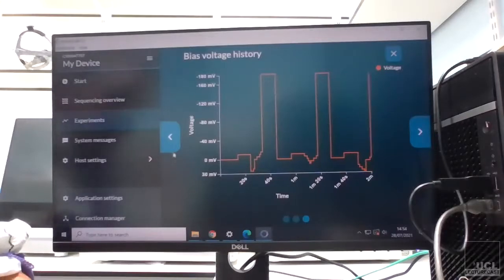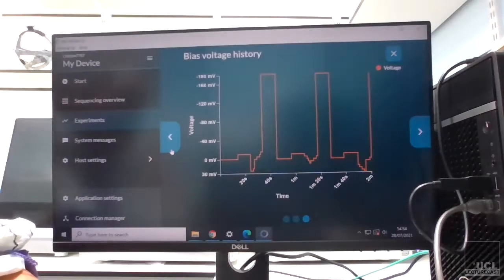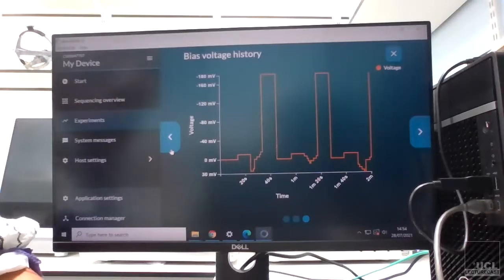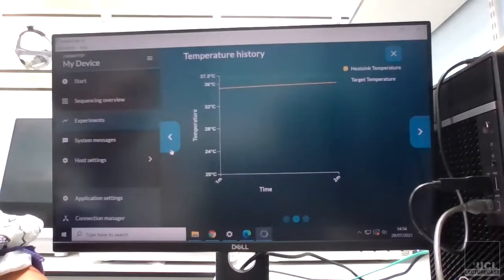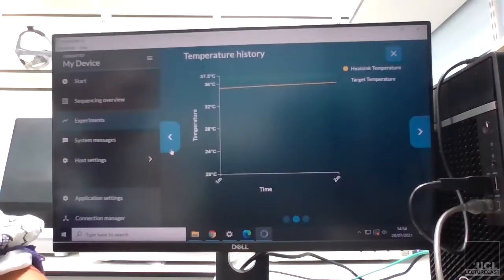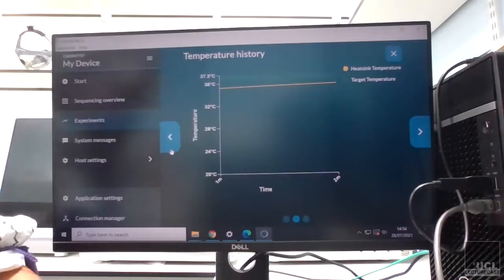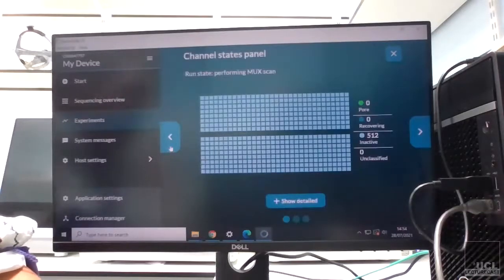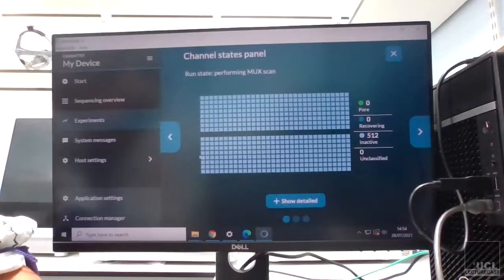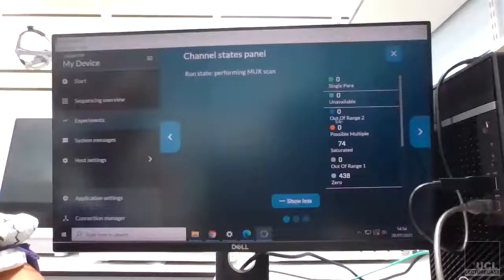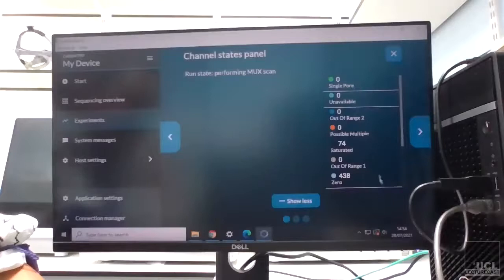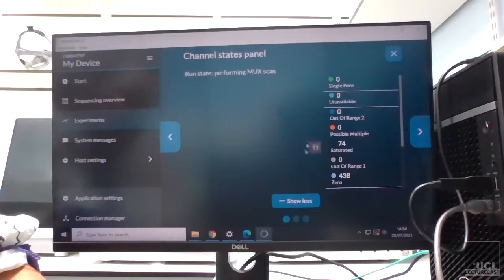And as I say, this will take—it seems to depend on the power of the computer, because my other computer is less powerful and it takes longer, whereas this one has 32 gigs of RAM, although it's only a CPU rather than a GPU, but it still seems much quicker. And that just tells you what the temperature is, but hopefully if it's running you shouldn't need to worry about the temperature because usually once it's going it's fine.